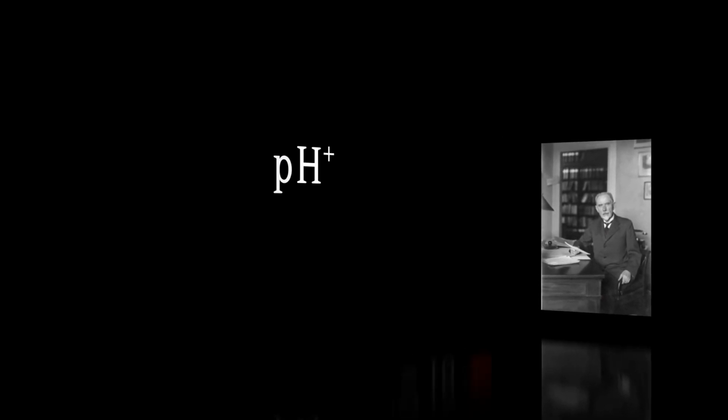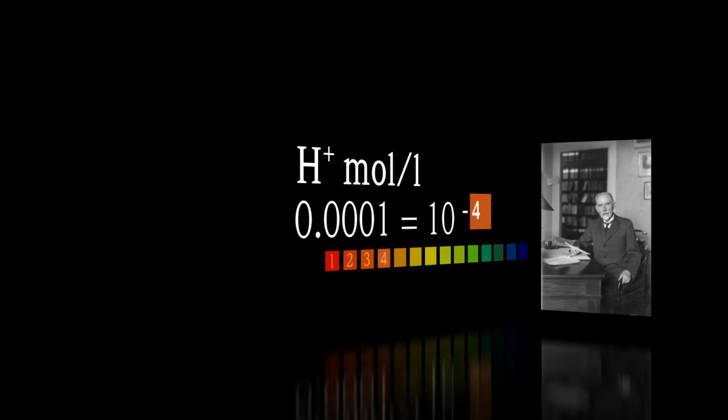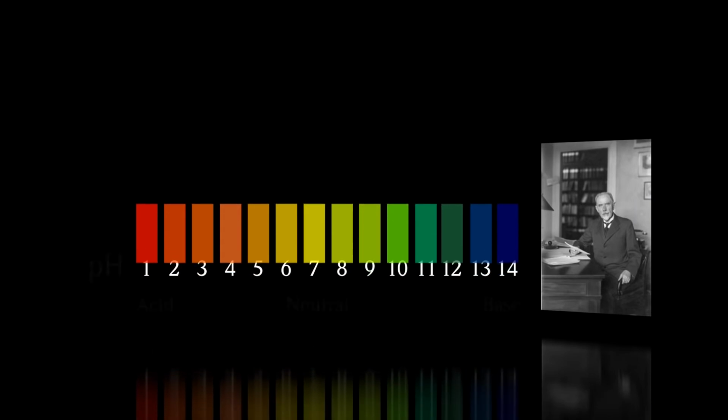One of these principles is pH measurement according to the potentiometric principle. The principle can be traced back to 1909, when the Danish chemist Søren Sørensen introduced the so-called hydrogen ion exponent pH, to describe the concentration of hydrogen ions in a solution. This was the basis for the development of the conventional pH scale.